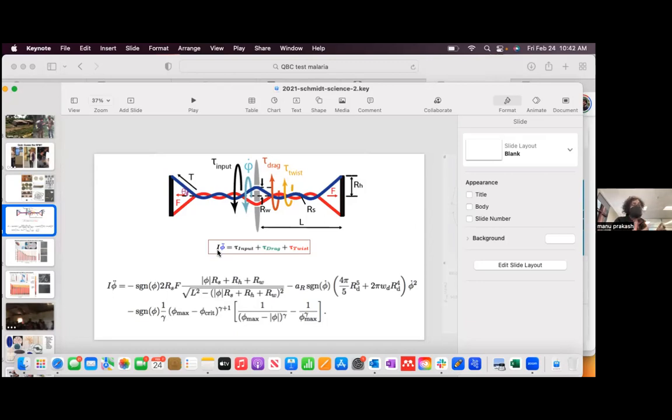And another thing, as a challenge I'll pose you guys, is we have tried certain sets of tricks so that although the object moves back and forth, can we have the disk only move in one direction? And then you can think about, could there be a ratchet mechanism in the middle to begin with? There's a special mechanism that allows you to do it. Yeah, ratchets will allow you to do that. And in two directions, when you move this way and then the wheel here still continues rotating. That's correct. Yeah, that's what we have in the handifuge.